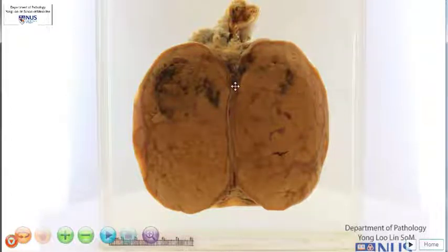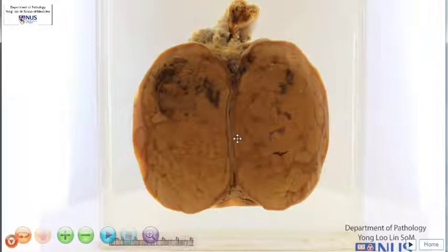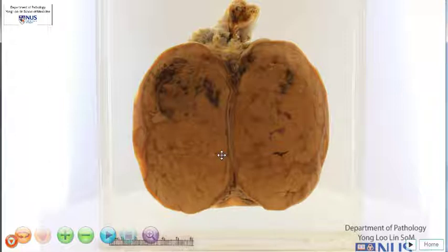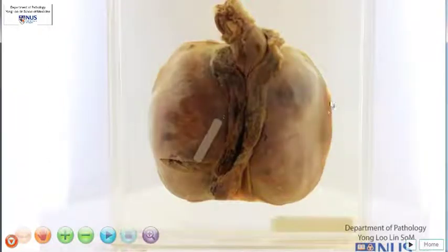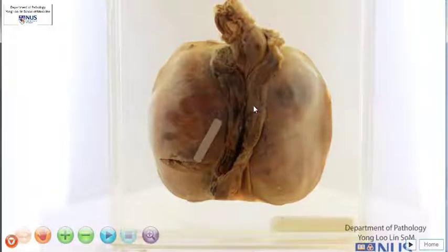Hello, this is a specimen of an enlarged testis. This has been bivalved or bisected longitudinally and opened, so we're looking at the cut surface. Just to orientate you, I'm going to turn it around. And we can see here, that's the tunica vaginalis. And over here, this is the epididymis. And of course, this is the spermatic cord.